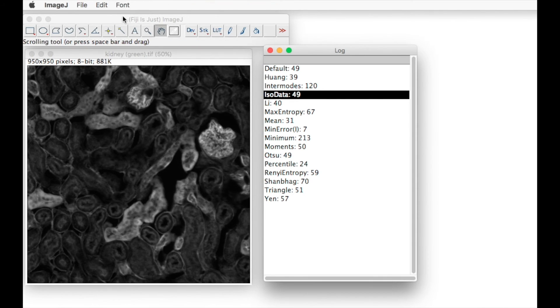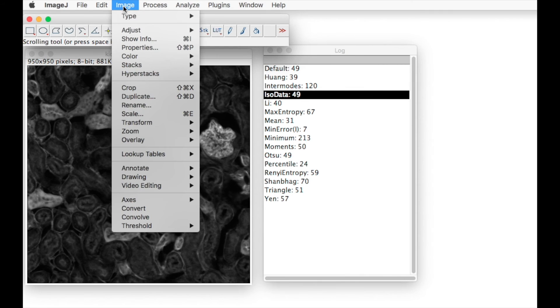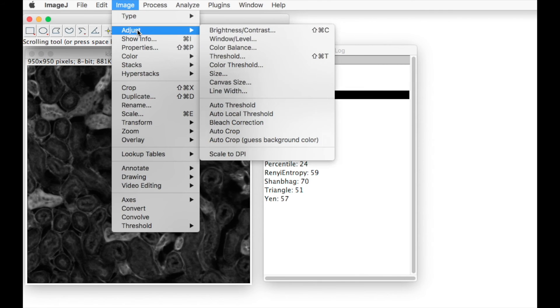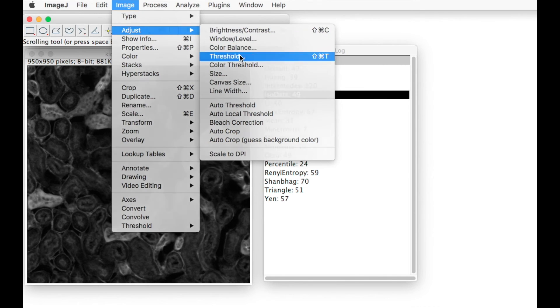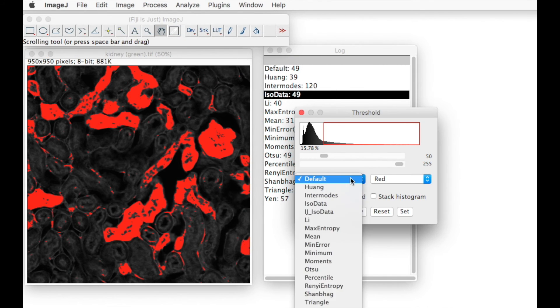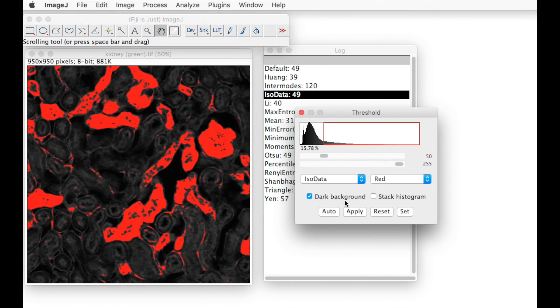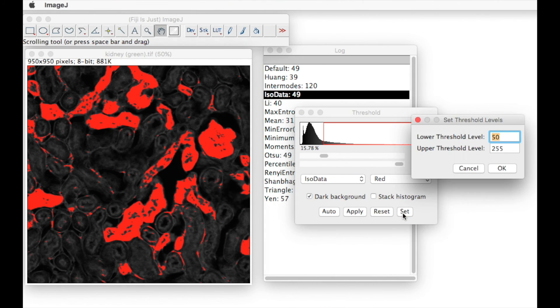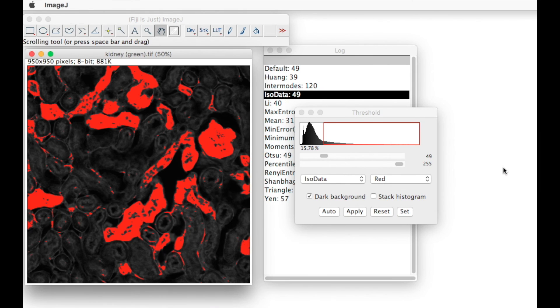Now we can go back to the original image. Image, adjust, thresholds. Select the ISO data, use the set function to set the correct threshold value of 49, click OK, and we have set our threshold for that image.